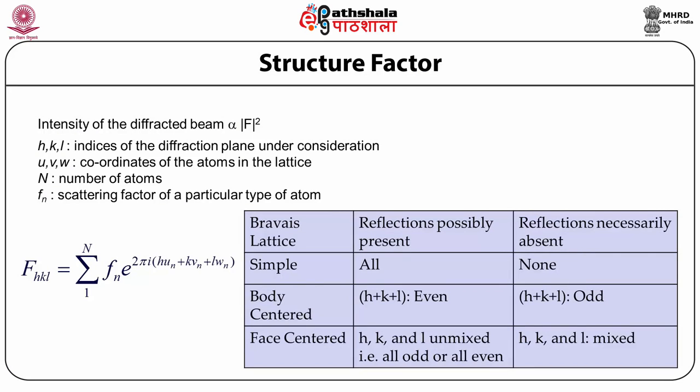The structure factor is a critical tool in the interpretation of scattering patterns, that is, the interference patterns obtained in X-ray diffraction, electron and neutron diffraction experiments also. The intensity of a diffracted beam is directly related to the amplitude of the structure factor. But the phase must normally be deduced by indirect means.